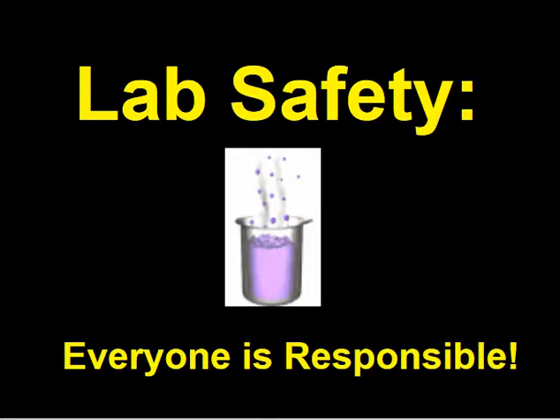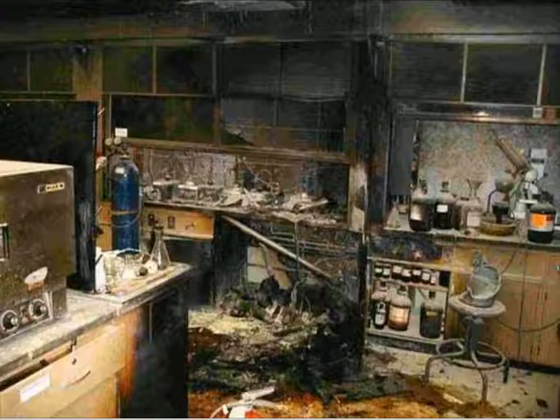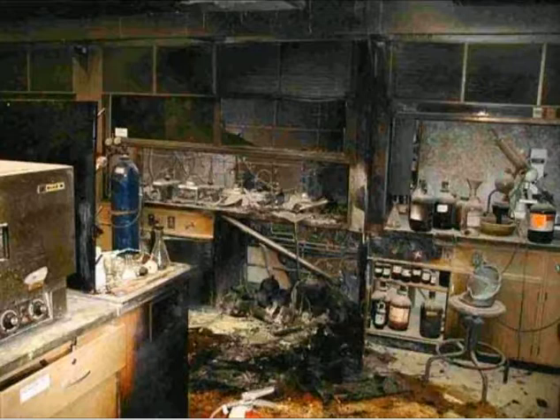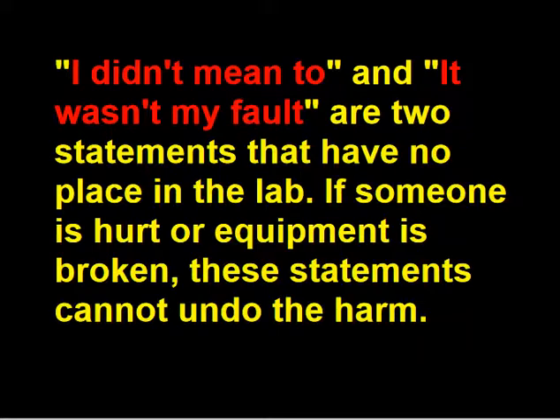And lab safety is everyone's responsibility. So it's yours, it's mine, it's everyone's. And what we want to potentially not have happen is this right here. And we never know what's going to happen in the classroom. If you remember last fall, there's an article in the Baraboo News Republic about an experiment that went awry in Reedsburg. And the teacher ended up going to the UW as well as a student, and they had some severe burns as a result. So you never know what's going to happen in the lab. You always have to be careful.